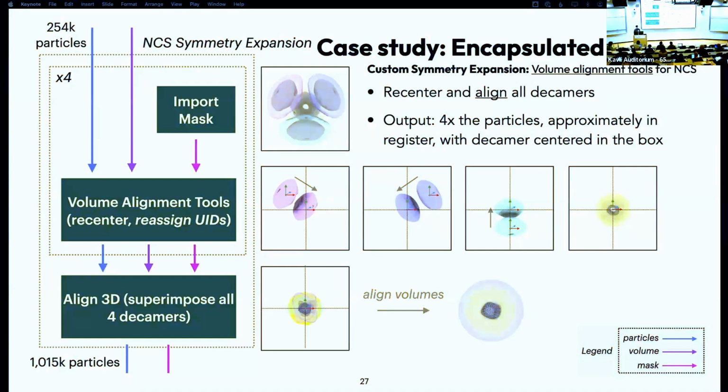Right, that's a really good point. Yeah. So there's like a big gap between the ferritin region and the Encapsulin shell. I pretty much know nothing about the biology of the sample, so I cannot comment on that. But I did try at least a virus that had a similar mismatch. I think a 5-fold axis was mismatched with a 3-fold symmetry object on top.